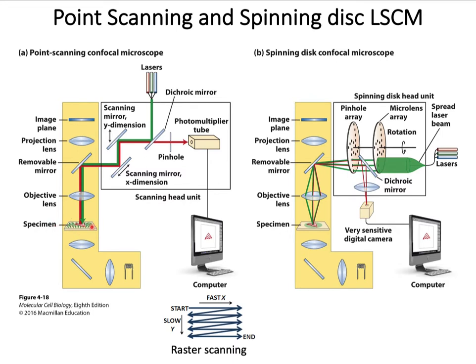Each of these single points will have a value on the X and Y axis. Using these mirrors, the laser scans the image on the X axis all the way from the left to the right. When completed, it will shift one point down on the Y axis and start all the way from the left again, all the way to the right, just as shown in this schematic.